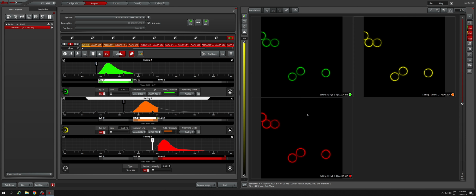So just click delete, click OK, and then for the images that we do want to keep, you have the project, and that'll have all of the files, all of the images you've taken that day, and you can, of course, rename that to whatever you want. So I'm just going to call it test. And you can also rename each series, each image individually. So in this case, I'll just go rename, and these are focal check beads. So I'm just gonna call it that.